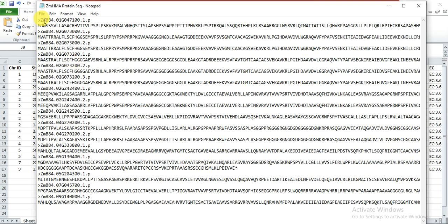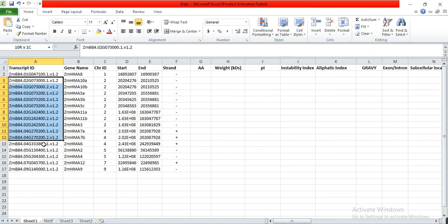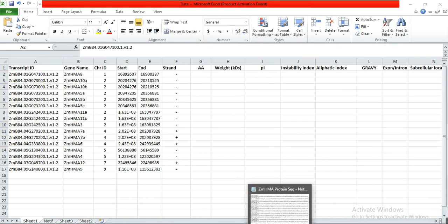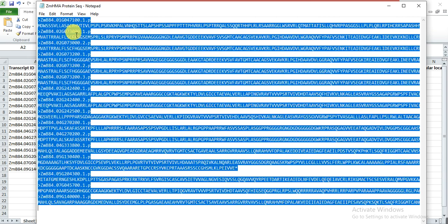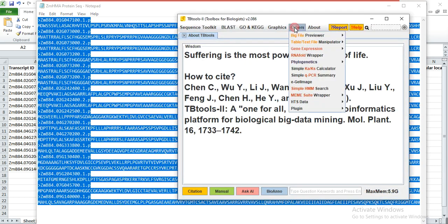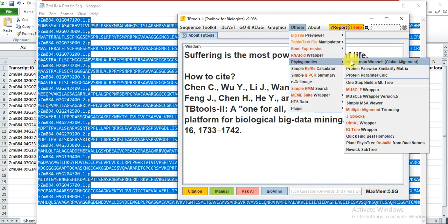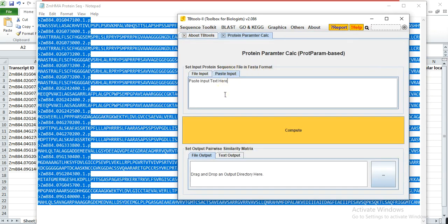Remember that the arrangement of these genes must be similar — the transcript arrangement in this column is the same as here, so you will get results accordingly, otherwise you will mix them up. Select all, copy, open the TV tool, go to Others, then Phylogenetics and Protein Parameter Calculation, and paste the input.